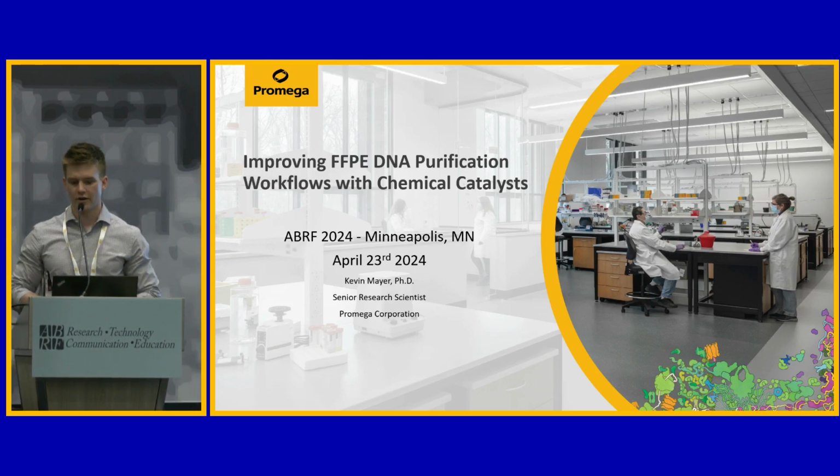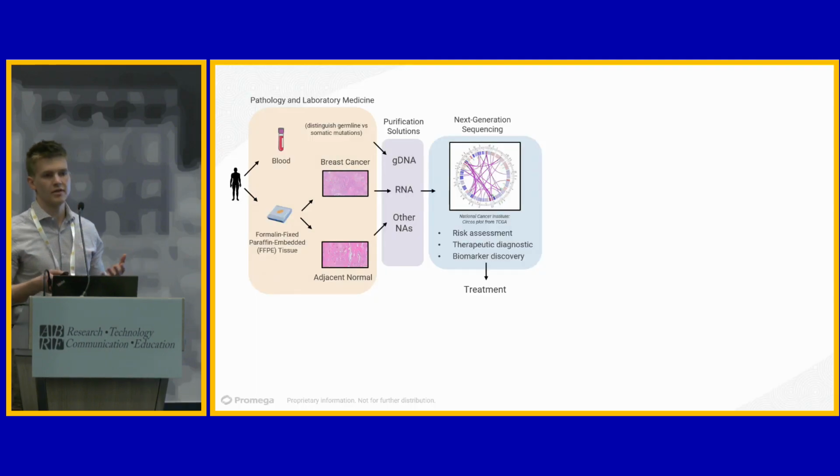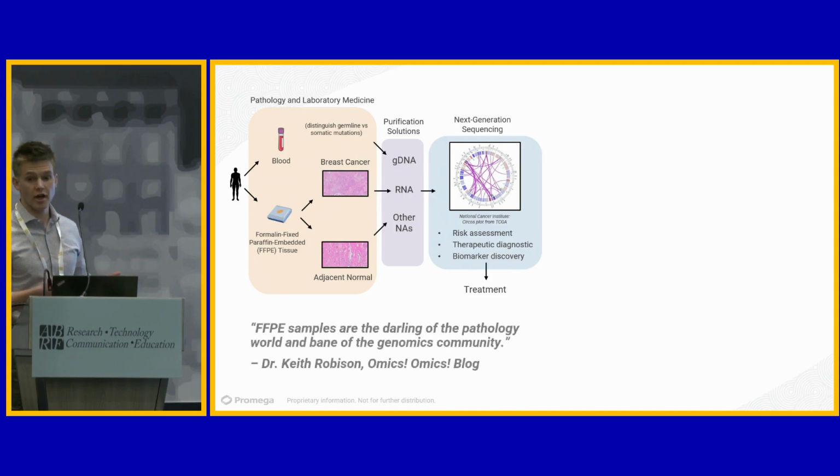Okay, good afternoon, everyone. I'm just going to get started. So FFPE is an important clinical sample type. Nucleic acids can be purified from it, and downstream assays like NGS can be used to understand the genetic basis of disease. But it's challenging to work with.